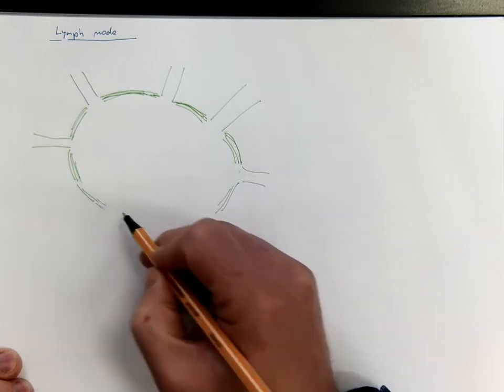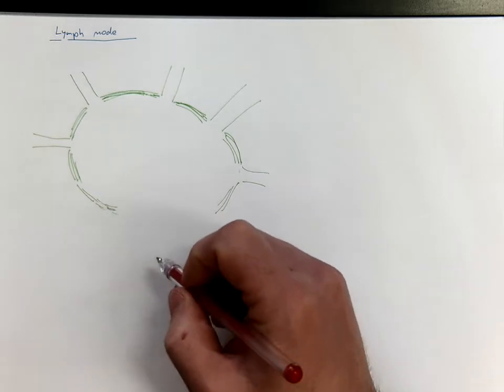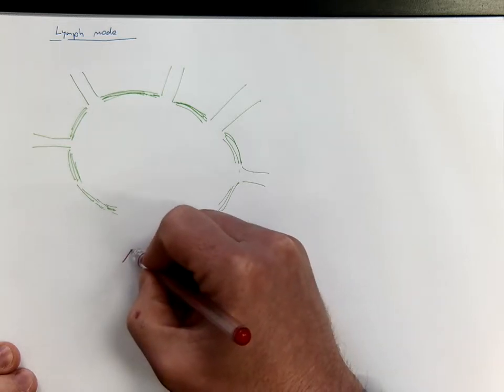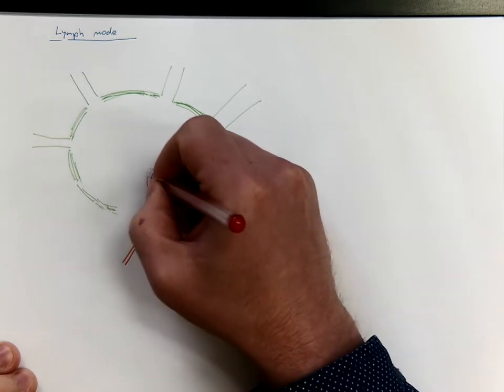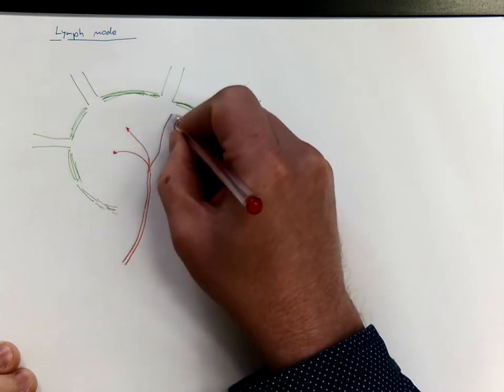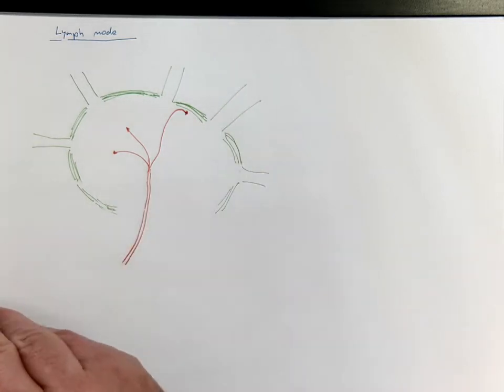And there is also the region with the blood vessels entering and leaving, which is called the hilum. So where we have usually a blood vessel, an arteriole that branches, goes to the region below the fibrous capsule.